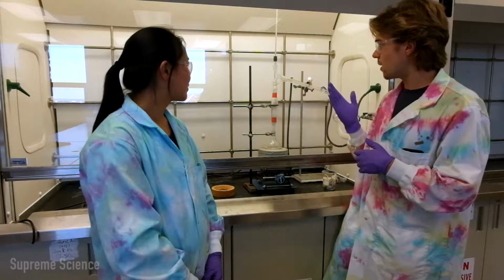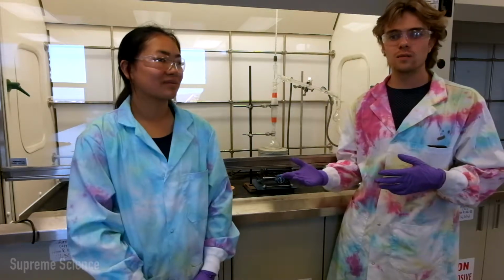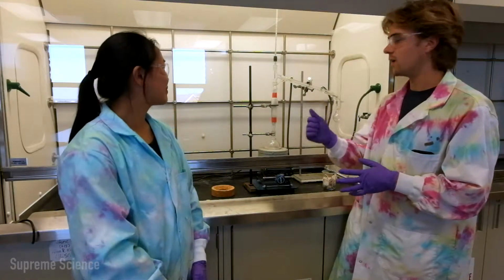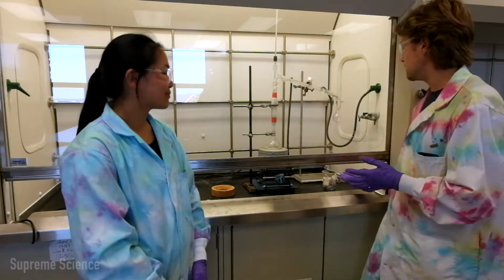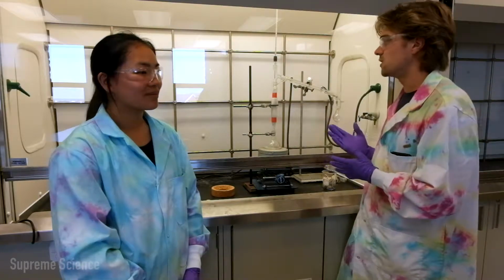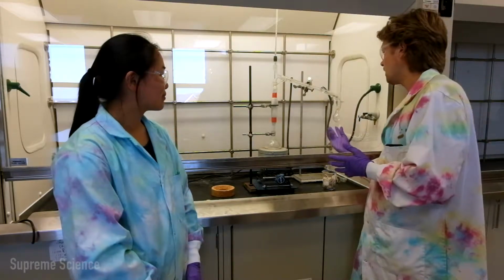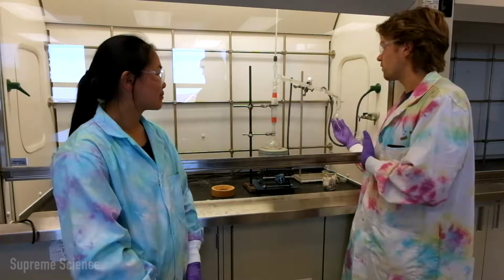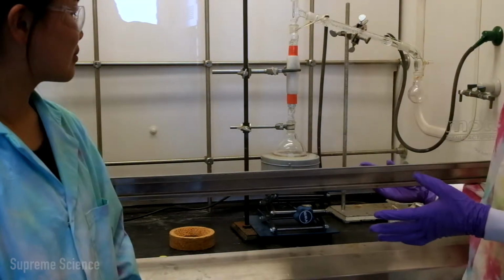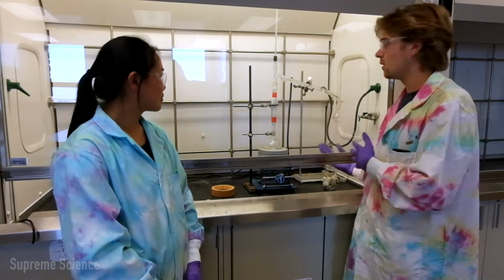When we reach the top of the column, the lower boiling point component is going to be the first to reach the top of the column and come down our condenser and end up in our receiving flask. So the way fractional distillation works, we have our receiving flask attached with elastics so we can easily remove it when our first fraction, our first component, has been isolated.